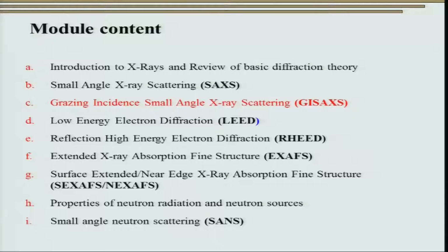Instead, these are very sophisticated techniques, and it is expected that you understand these techniques and get exposure to them, and then carry out your preliminary characterization using laboratory scale X-ray diffraction and other characterization tools, and then you go to these advanced characterization techniques in order to solve your problem of importance. So, let us start talking about grazing incidence small angle scattering in the present class.